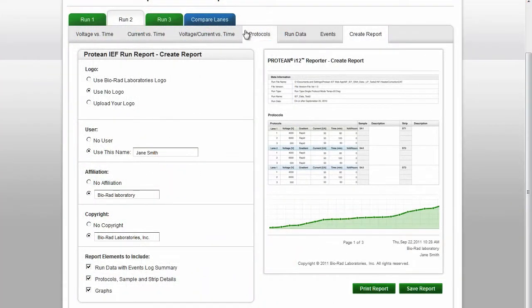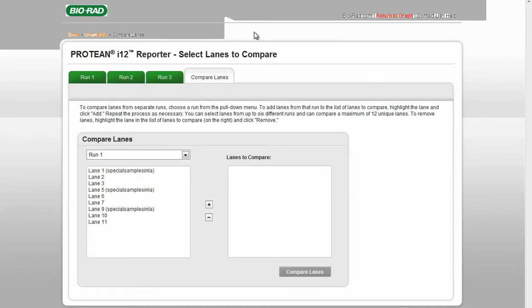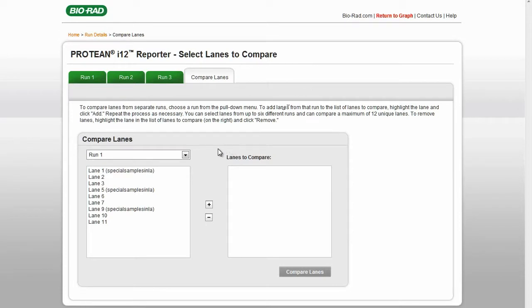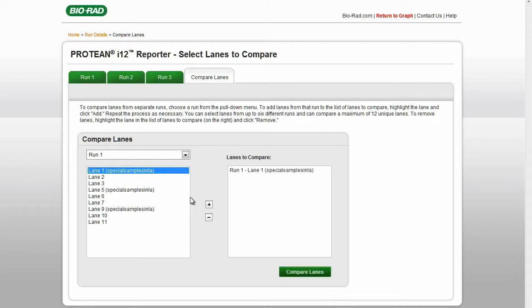To compare data from multiple experiments, click the Compare Lanes tab. Choose the run and select the lanes you would like to compare. Click the Plus button in the center to add the chosen lanes to the comparison.